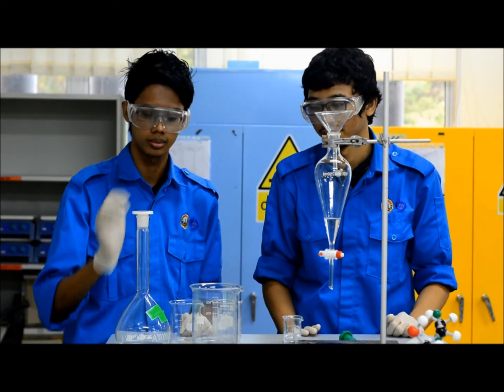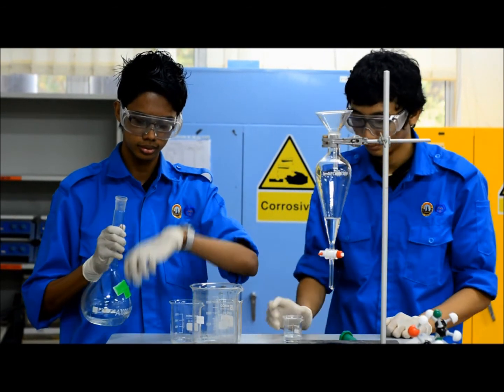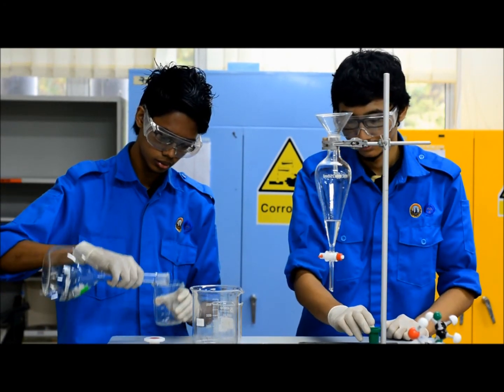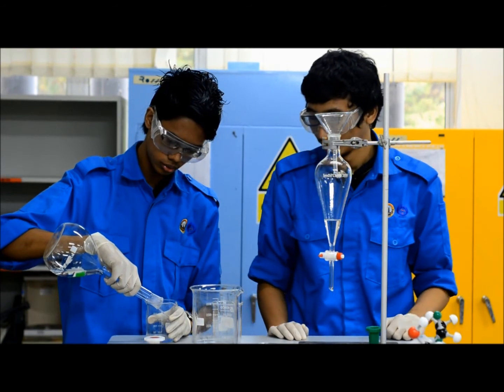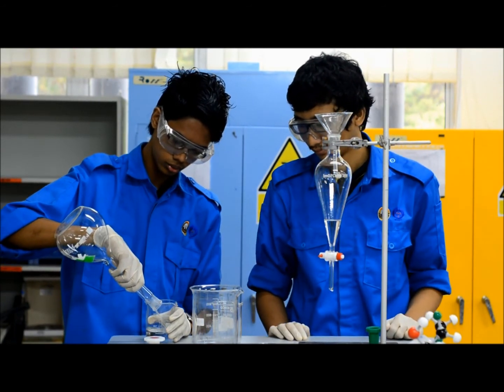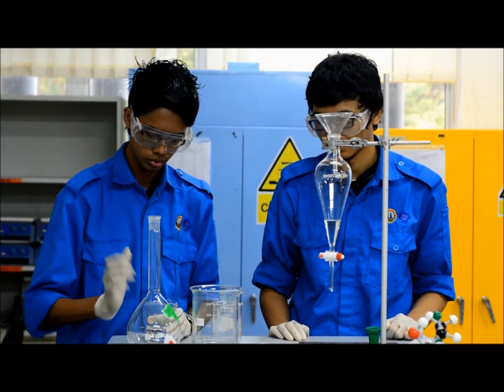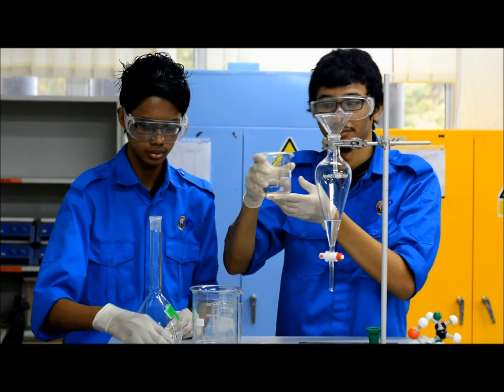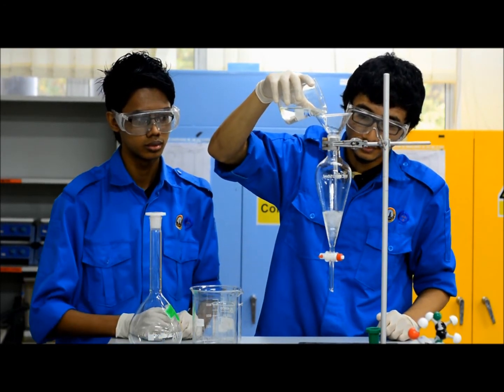For the next step, we pour the sodium hydroxide solution into the beaker. Hence, we insert the sodium hydroxide to mix with the solvent.